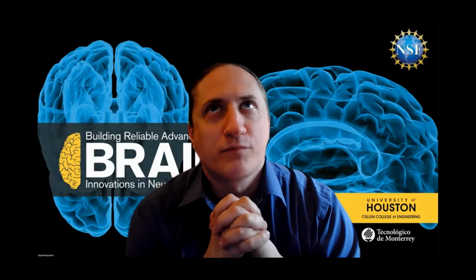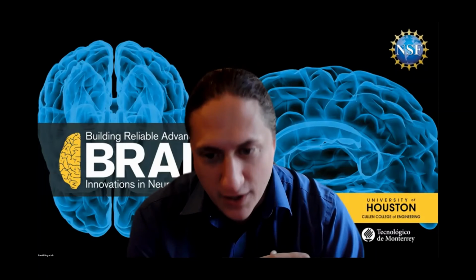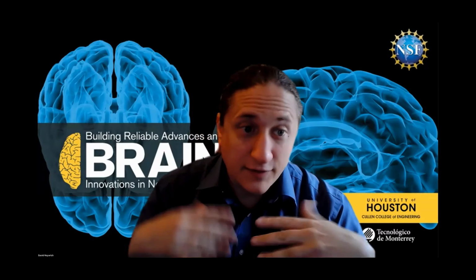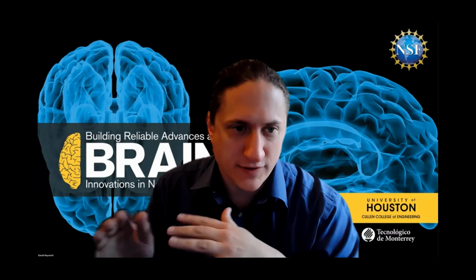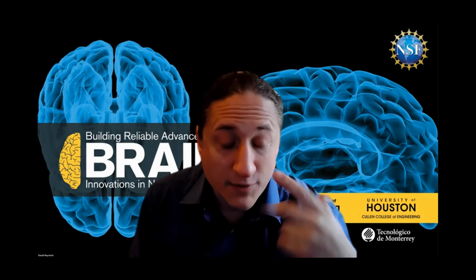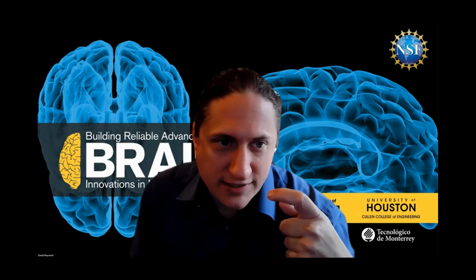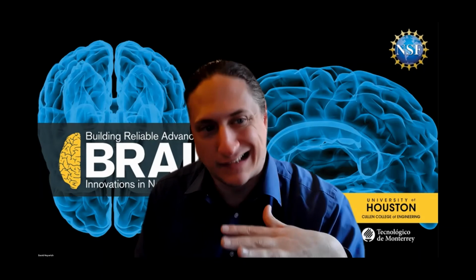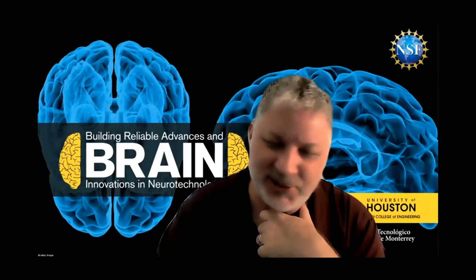Yeah, okay. So the only issue with human tissue is that we have to introduce contrast somehow. The technique that we're working on is very fast, and the speed and the resolution are the advantages. So we have to find some way to introduce contrast. We're doing that by injecting India ink transcardially. That's difficult to do with a human, and they probably wouldn't let us do that.